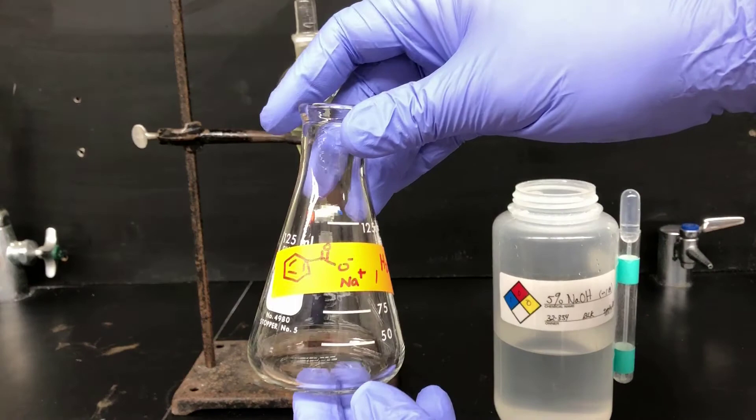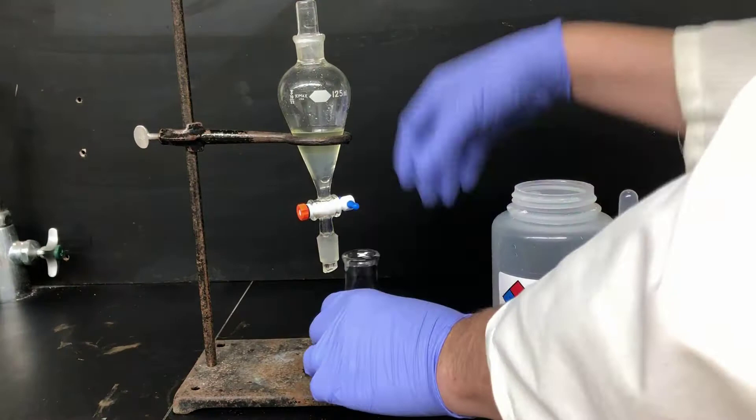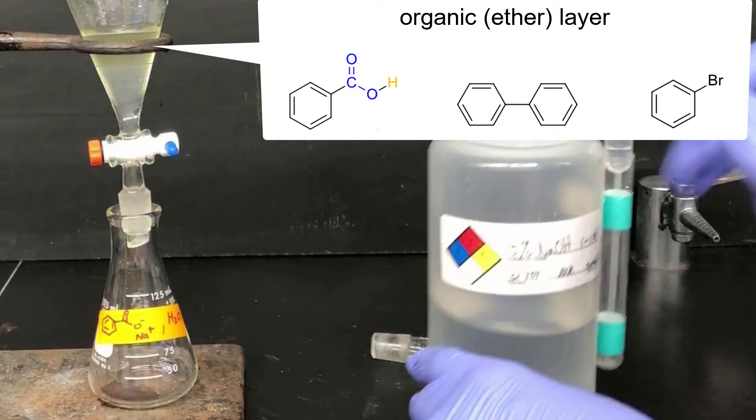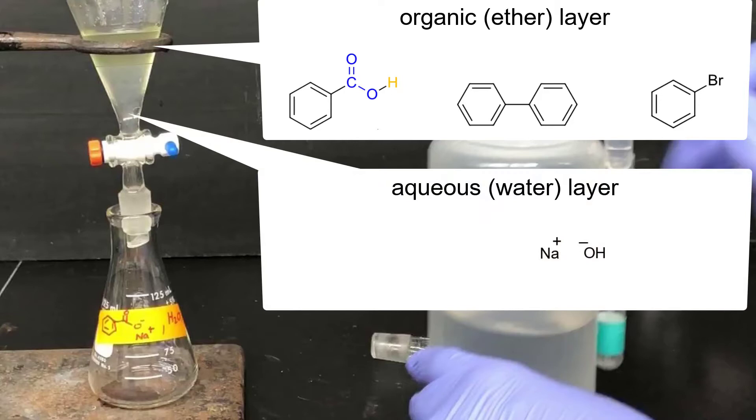Then, when I separate the layers, I'll separate the compounds. Benzoic acid used to be present in the organic layer, along with the biphenyl and the bromobenzene. However, when we put the aqueous solution of sodium hydroxide in, it got deprotonated, which made it into a much more polar salt, so it migrates into the water layer. Now the salt of the product has separated from the organic impurities.